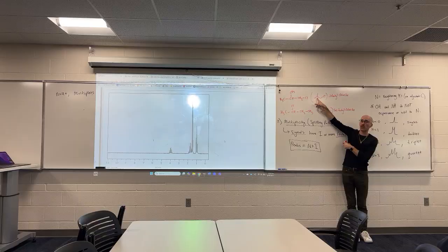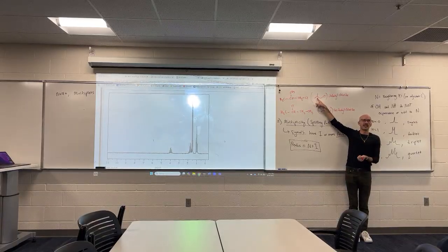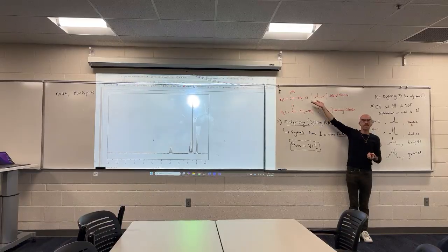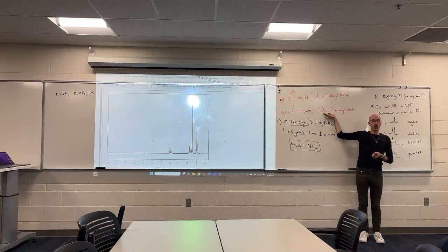They're attached to the same carbon. So they would give one signal that integrates to 6H, not two different signals integrating to 3H. But you know what? We were just piecing together our puzzle. We were just checking. So that's a fair thing to do. And now that we've done it, we should realize it was never going to happen anyway. Which means this is really the only structural isomer we could have predicted.